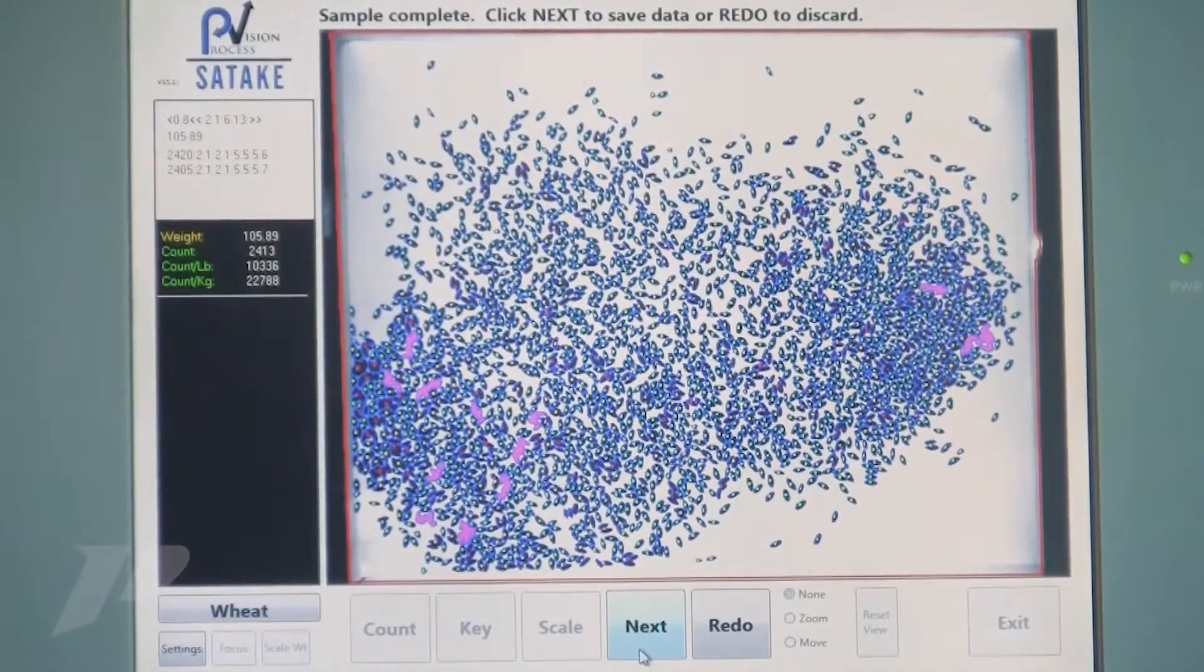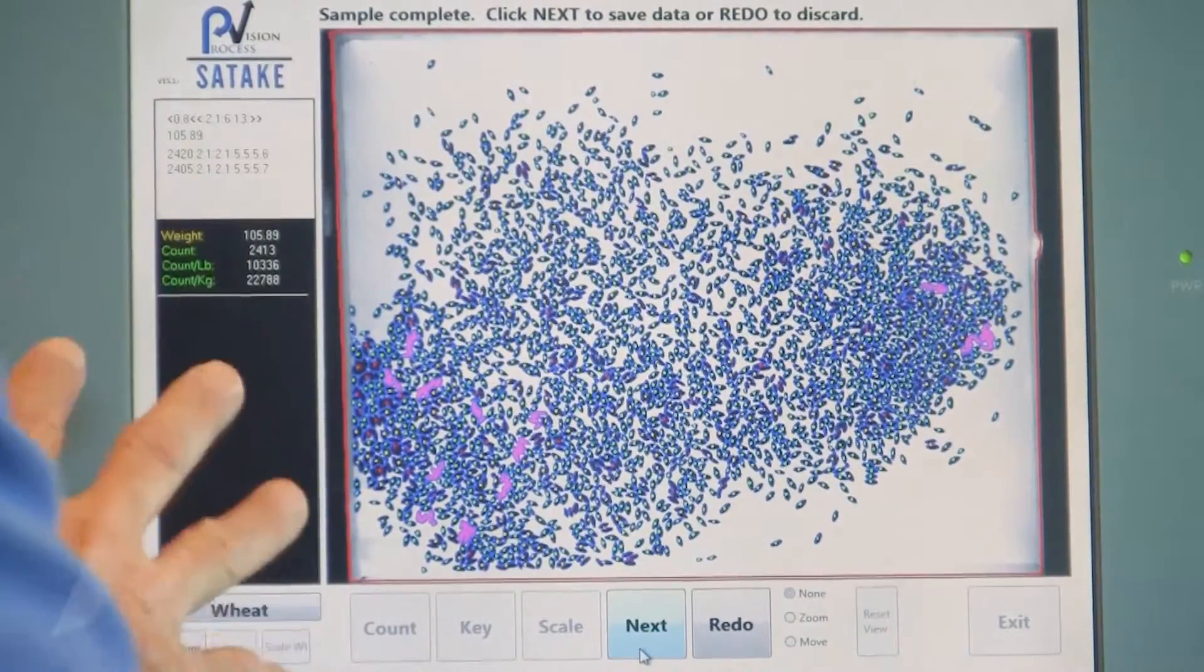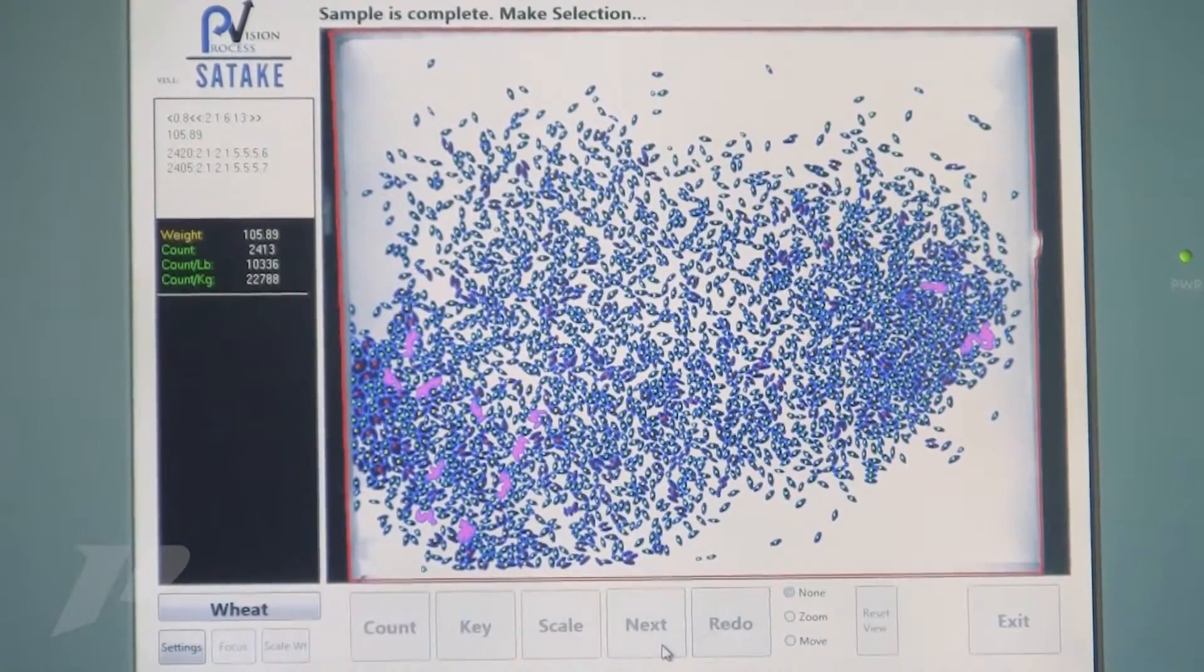We're within plus or minus seven and a half, which is close enough for the settings we have here. So we will accept that product. We'll say next.